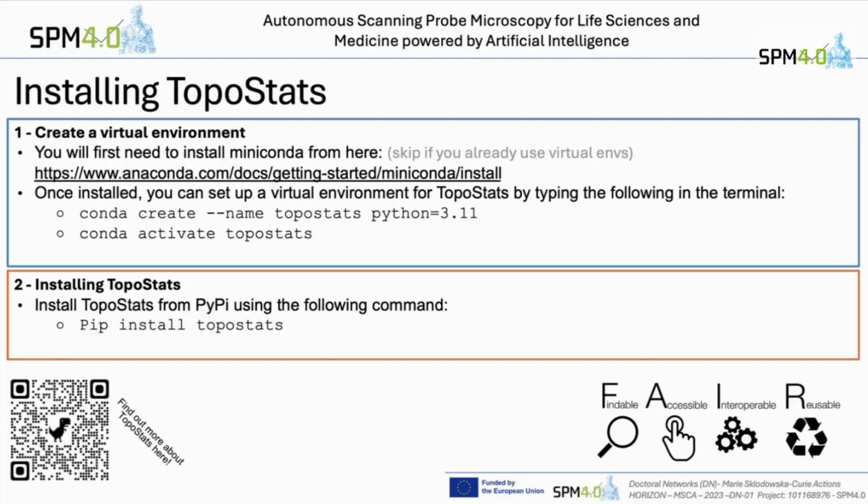It seems to be okay. In theory, it should work quite well this time. Is it correct? The reason that one is called Windows, so we can see that. It's all about whether they do it, the changes.